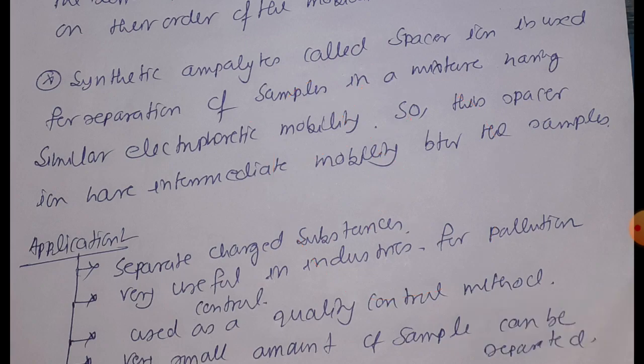Now let's take a situation where your sample mixture has two samples that have very close electrophoretic mobility.